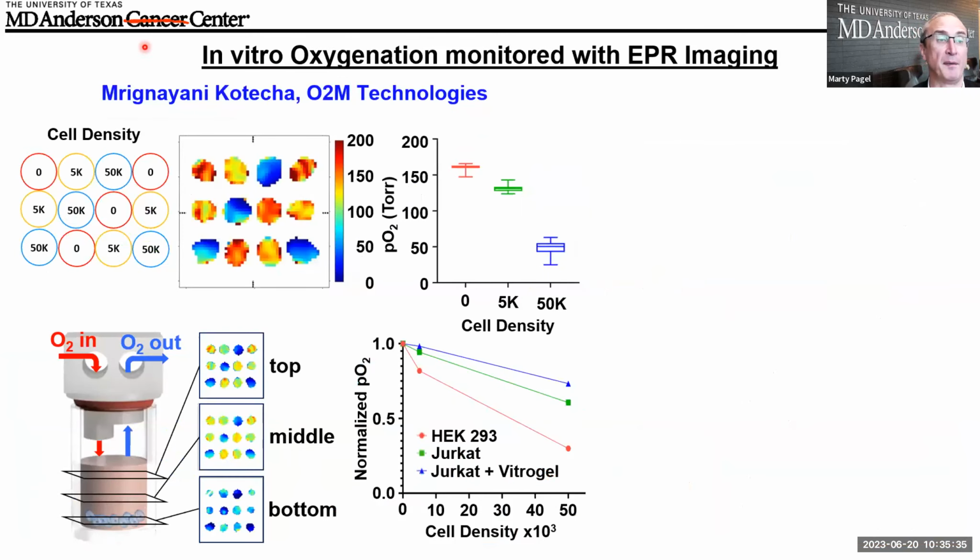All right, so I'd like to switch over to a few other topics then for using EPR imaging. Marignane Kotecha and her colleagues at O2M Technologies have developed a very nice system for looking at in vitro cell cultures.